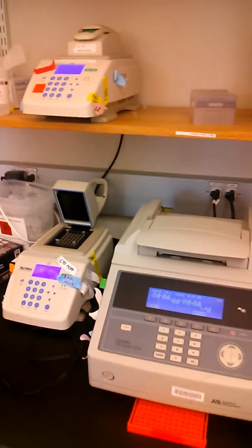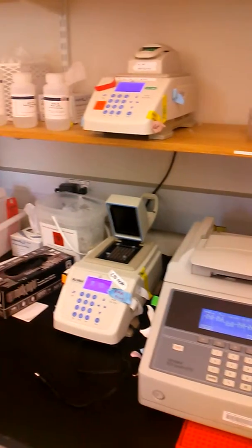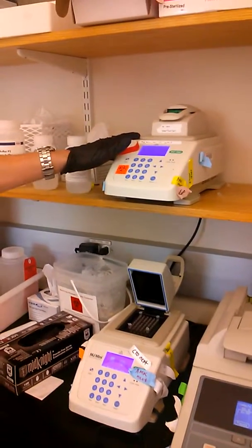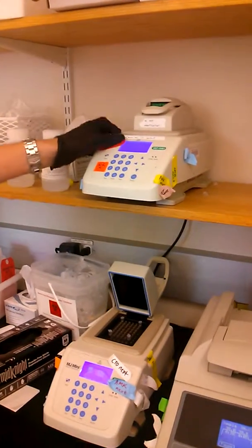So we have three different thermocyclers. These two are identical. And that's the instrument that's going to control the temperature to make sure your PCR reaction works.